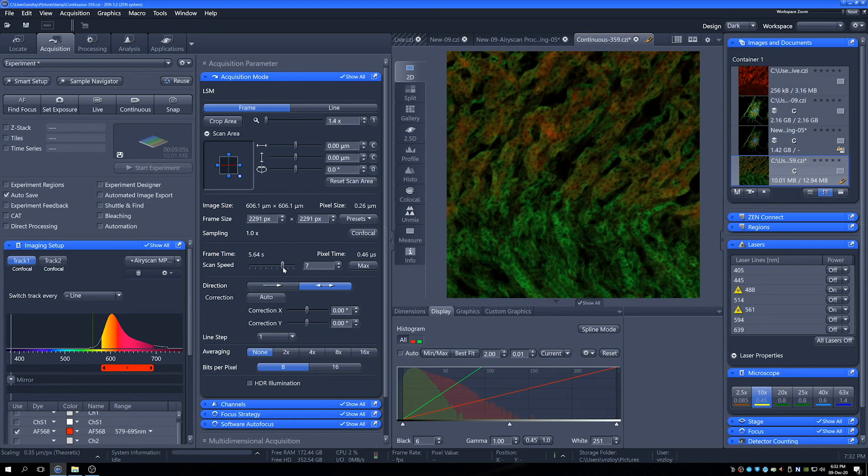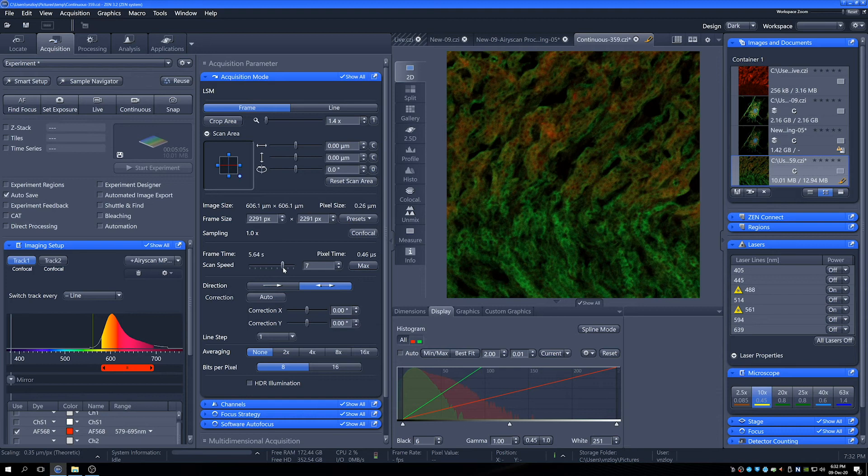This is really dependent on what our needs are. If we have dynamic samples, then we need to scan quickly. If we have fixed samples, then maybe we can afford to scan for a bit longer just so we collect more photons and we get nicer images.